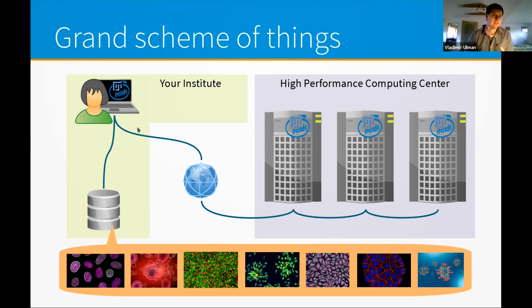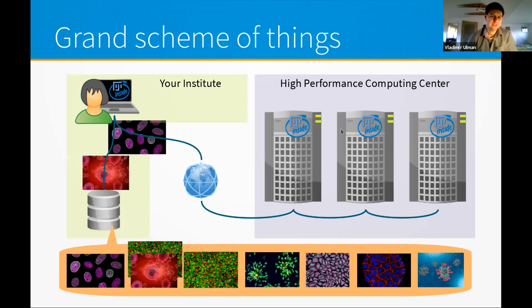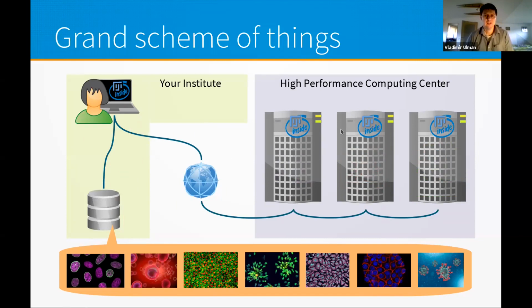So far, we were installing software on our laptop that allows us to do that. And we will now be looking at the steps of how we can connect and get in touch with this remote center. And then the idea, I'm sure you already see it: we will have to upload the images, and then the images will arrive at these multiple computers there and will be computed at the same time with exactly the same script. Of course, not only the data, but also the script has to be transferred. So that basically involves additional steps.